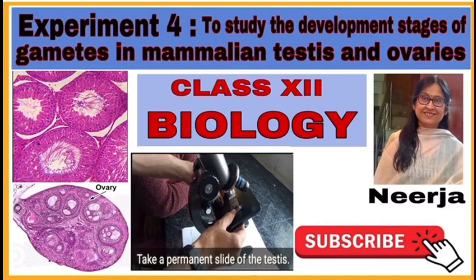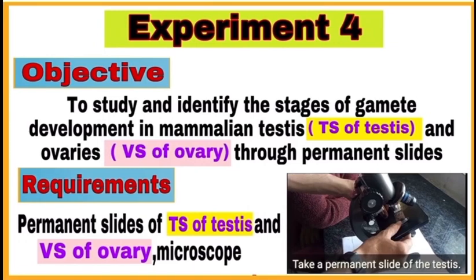Hello students, this is the fourth experiment, that is to study the development stages of gametes in mammalian testes and ovaries. Let us learn what to write in practical notebook about this experiment through this video. Start writing the experiment with objective. It is to study and identify the stages of gamete development in mammalian testes and ovaries through permanent slides.